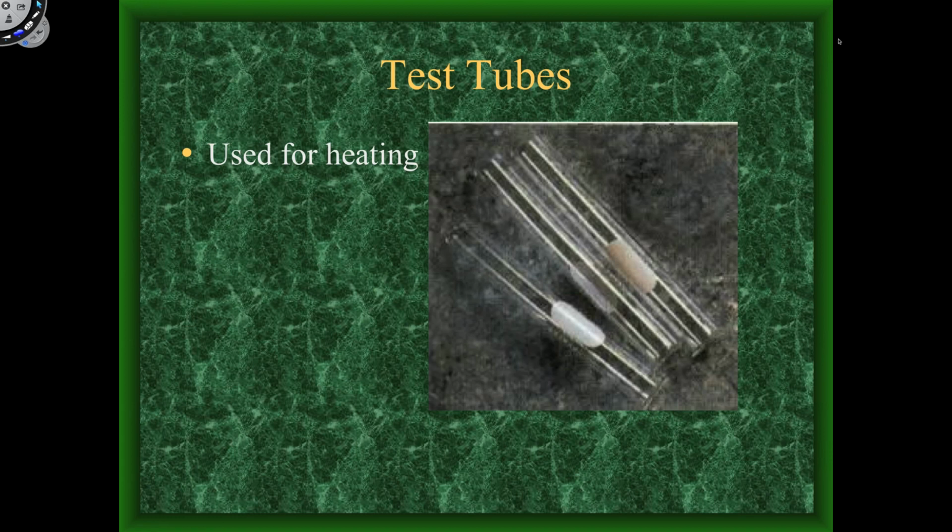So test tubes, heating, a lot of equipment that we talked about is used with heating, but test tubes really, that's their only use.